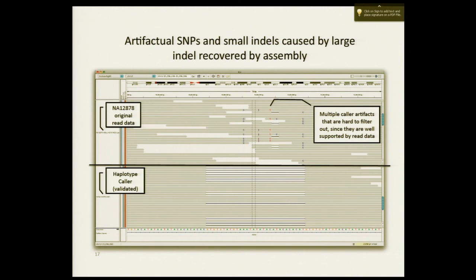We don't even know what those bases are, so there's no way to figure it out base by base, because that's an insertion, right? So we don't even see those bases. That could be anything. But what it's saying is that when you put this part of the read over on this side, then it's matching the reference, and there are no mismatches, right? Just like with the indel realigner example you saw yesterday. It's just a larger case where that happens. So these are the same reads. It's just that when you shift that stuff over here, then it matches the reference. Make sense?